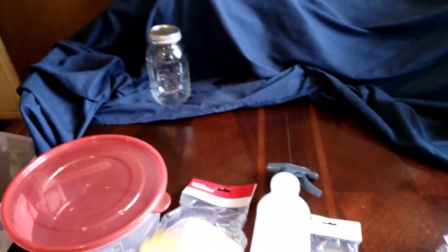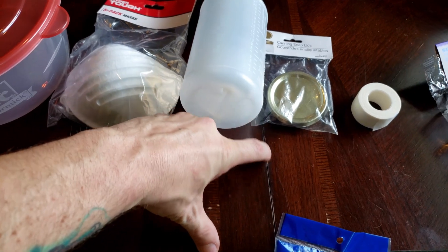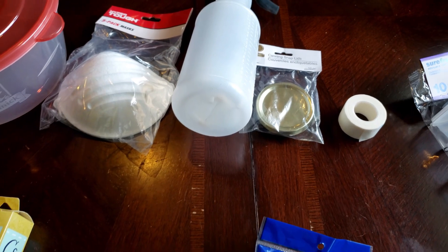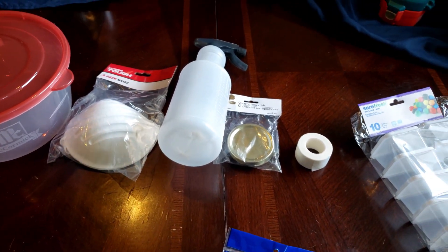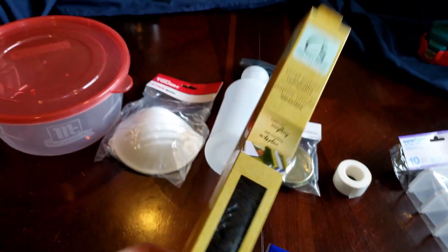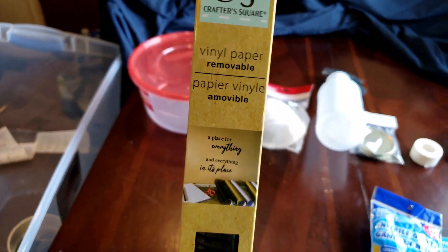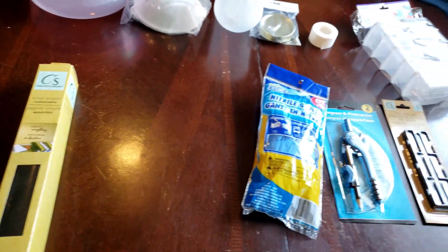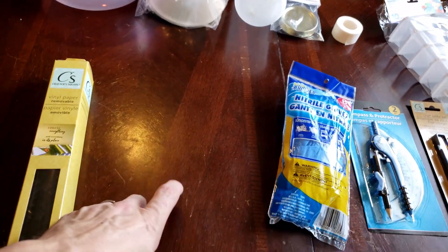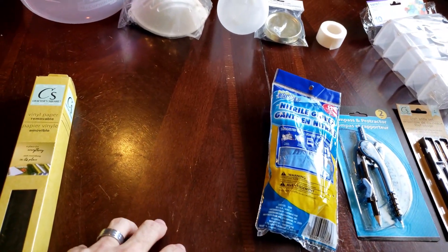Removable vinyl paper — this is super important for some of you. Not everybody has stainless steel to work on; some people are working on tables. This crack in a table can fill up with all kinds of things, and even if you pull it apart and clean it, you're not necessarily getting everything out. So if you have a problem with a countertop or tabletop you can't fully clean, get some removable vinyl paper from the dollar store, lay it down, and then sterilize that surface instead of the wood.